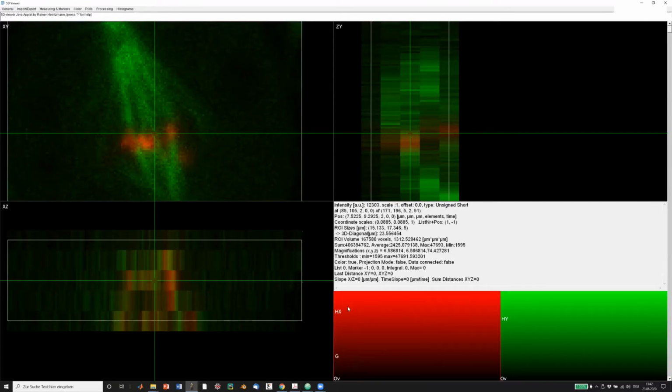And in the element panel, you see the color maps printed from dark to bright for these two elements. And they can, of course, be not only two, but there can be theoretically hundreds of colors. And this can sometimes also be misused for presenting things like fluorescence lifetime decay curves. So there's a context menu here, and there's another context menu here, which allows you to select which information to show in this text view and which not, and the font size.